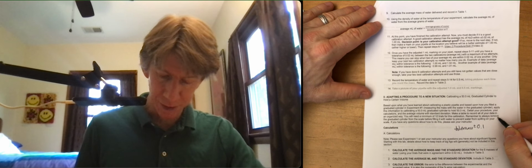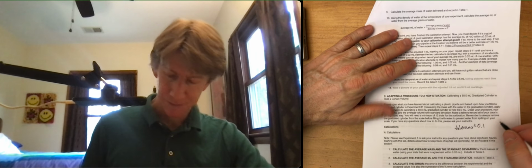Remember to always remove the graduated cylinder from the scale because you don't want to tip any water onto it, please. And if you have any questions, please ask me.